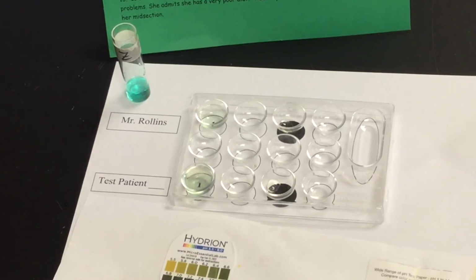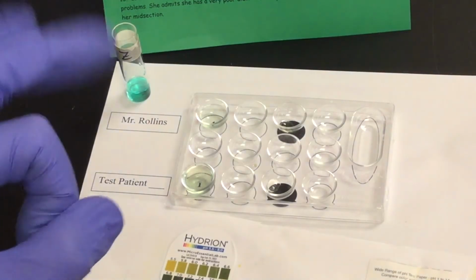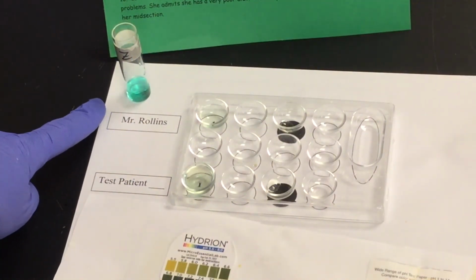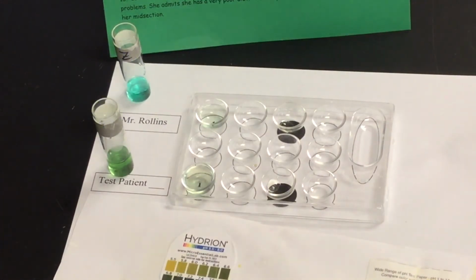At this point we go back, get our glucose tube off of the hot water bath, and look at it. We know Rollins is our control patient. That control patient is blue, kind of that turquoise blue. He is negative for glucose. So any change from that particular color is going to mean that we have a change in glucose.